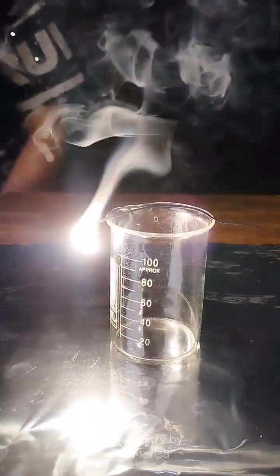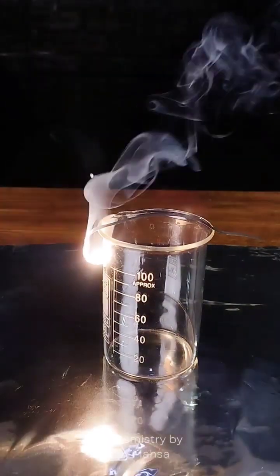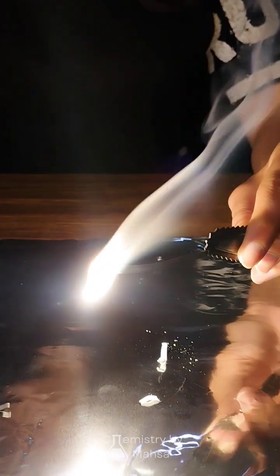As you can see, when magnesium burns, it produces an intense white light and a lot of heat. This is because it's reacting with the oxygen in the air to form magnesium oxide.